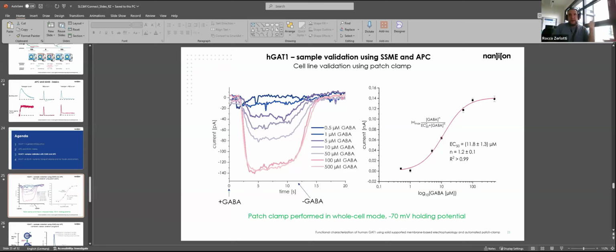So for that, yeah, you would need something else. Exactly, like, I don't know, a fluorescence readout of whatever is on the sensor, or something similar.